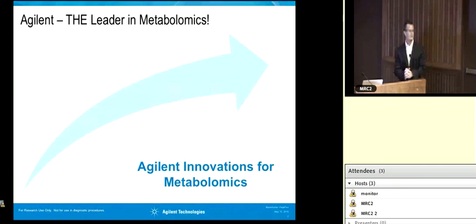So you'll determine your tracer, and one additional point is that ProFinder also allows you to determine the purity of that tracer, because if you go to Cambridge, for example, and you order U-13C glucose, it's going to be 99%, 99.5%, whatever. So that affects the calculations, right? We've already seen that when we do the natural abundance correction. So important thing to consider.